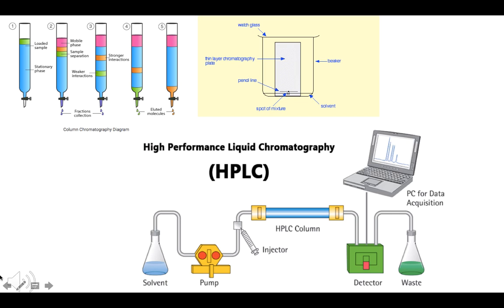So an example would be a chromatography where we have hexane and butanone mixed together. If you let some time pass, the first compound to elute would probably be hexane because it's more nonpolar than butanone. So that's how you separate two compounds. So remember, a high Rf value means you're nonpolar and you leave fast, and a low Rf value means you stay longer.